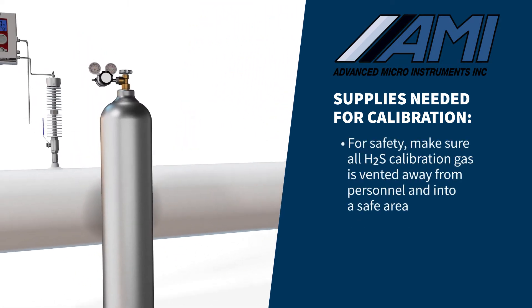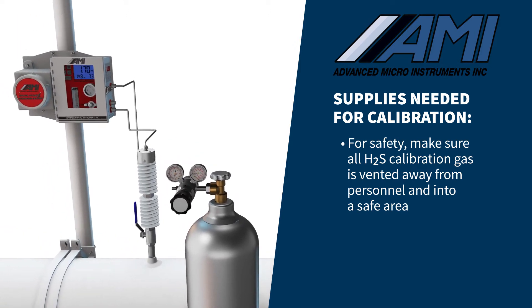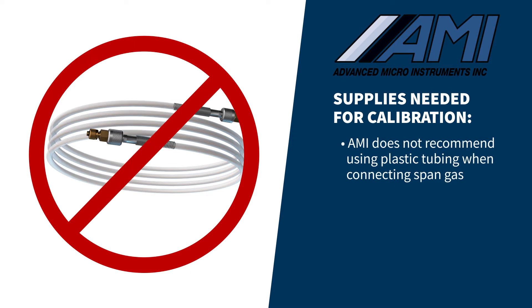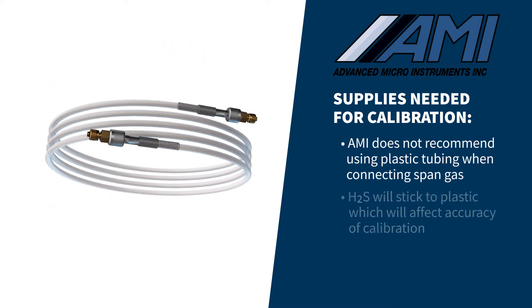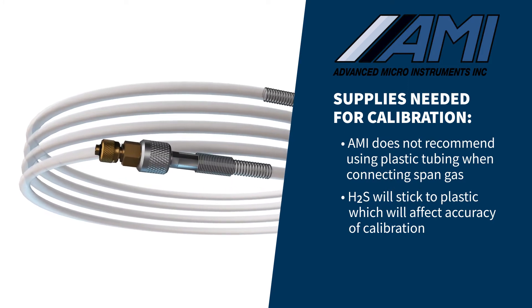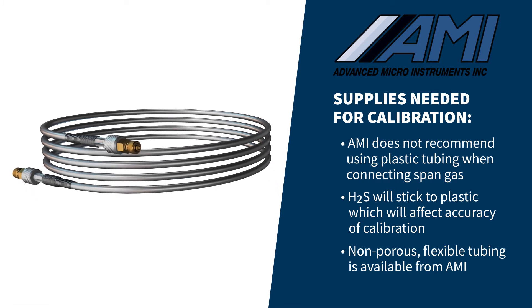Additionally, make sure that all H2S calibration gas is vented away from personnel and into a safe area. We do not recommend using plastic tubing when connecting span gas to the analyzer. Plastic is very porous on a microscopic level and H2S will tend to stick to the tubing wall, affecting the accuracy of the calibration. Non-porous, flexible tubing is available from AMI.